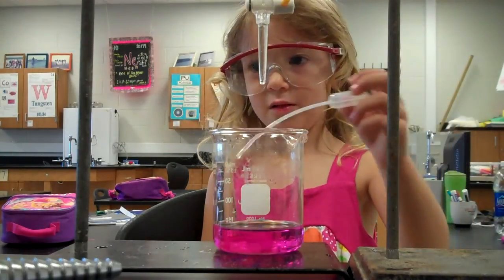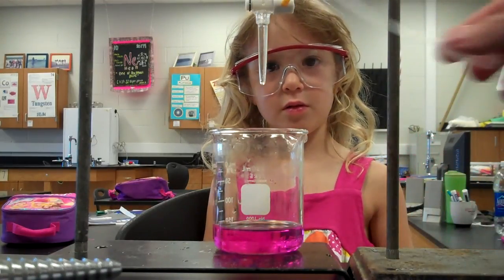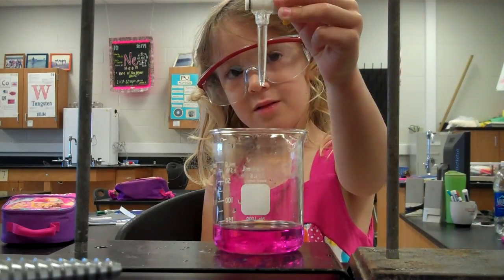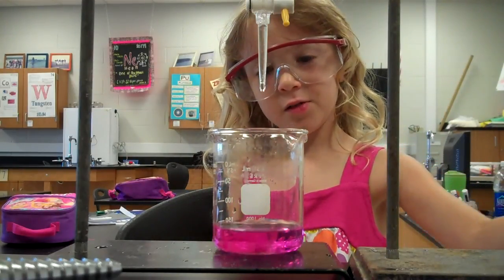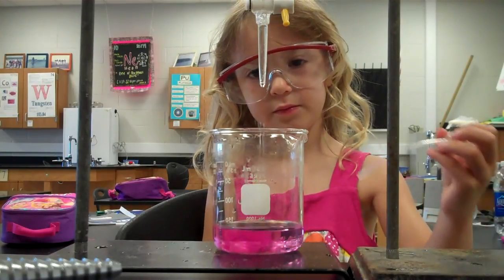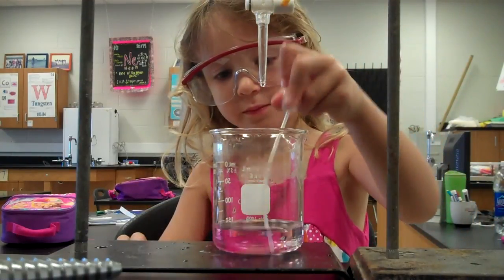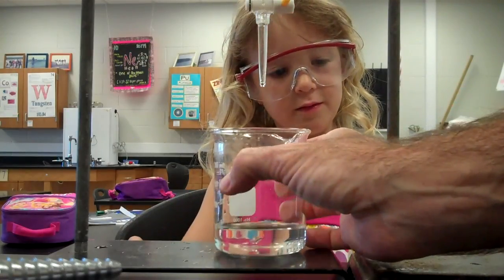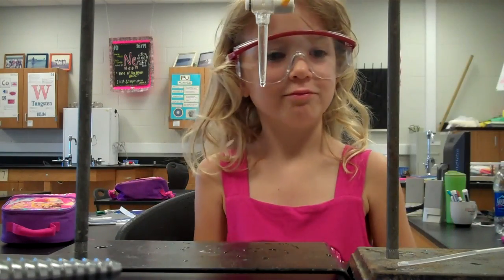Drip a little bit of acid in there. Which acid? From the burette. Turn it back on. Gently — there you go. Perfect. Do I need to mix it a little bit more? Let's see. All right, cut it off. There you go — now mix it. Good job. And you know what we have in here? You know what this clear stuff is? It's salt water. Yeah. Good job.